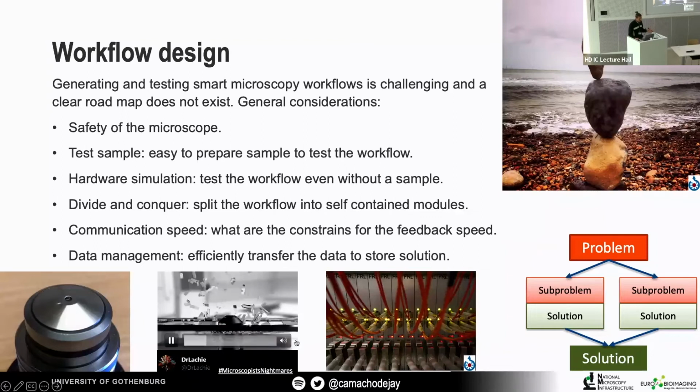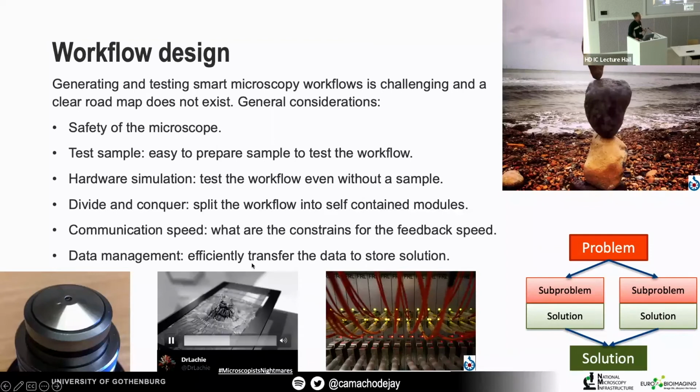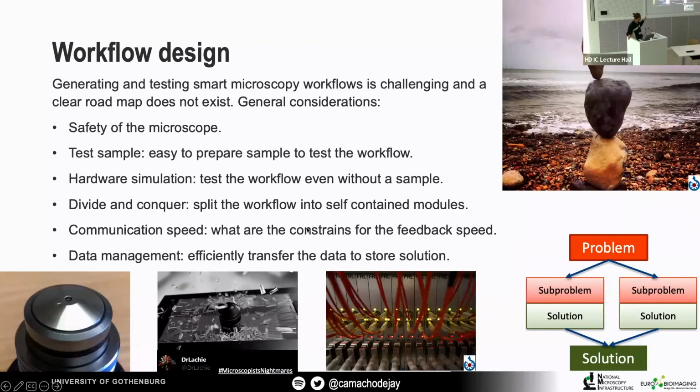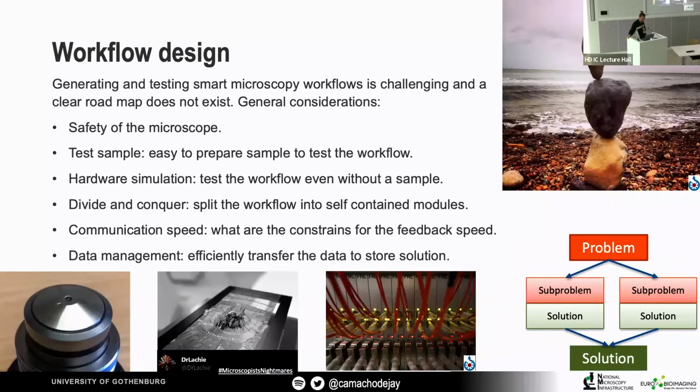So you see this beautiful video. I don't know if you follow that on Twitter, but that's great. These microscope nightmares. So, you know, that is my nightmare. That I'm going to program my microscope, I'm going to make a mistake and I'm going to ram the objective into the sample, right? And that is a huge worry for all of us working on automated microscopy. I see some smiling faces. I think this is not my own nightmare only.